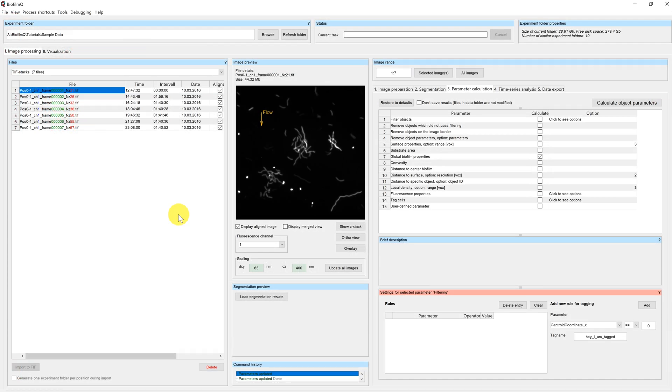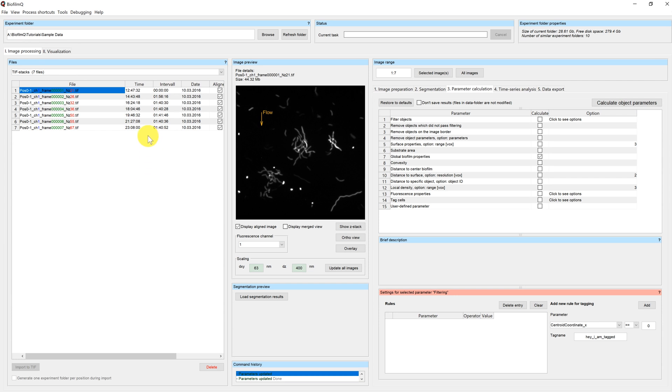Welcome to this BiofilmQ tutorial. My name is Hannah and today we're going to have a first look at the visualization tab. In previous tutorials we have worked in the image processing tab. We have learned how to load your data files and how to process them in order to get information. Today we're going to have a look at the visualization tab where you can create plots.